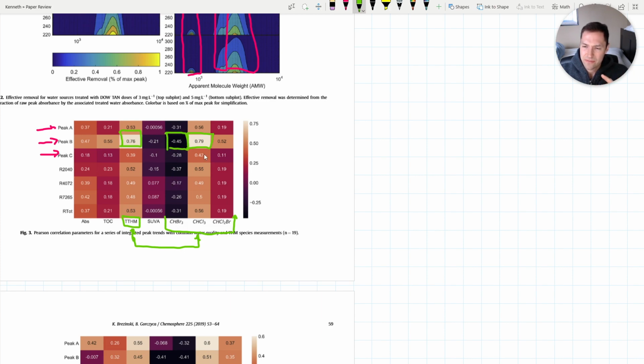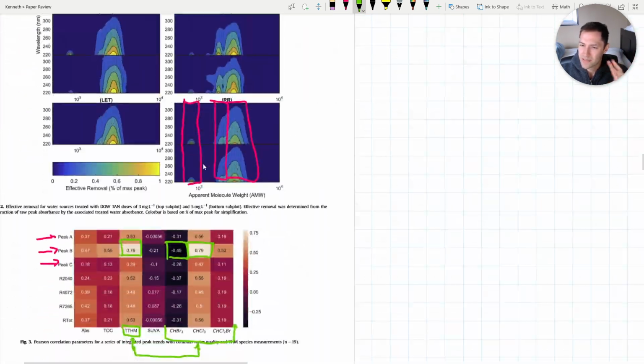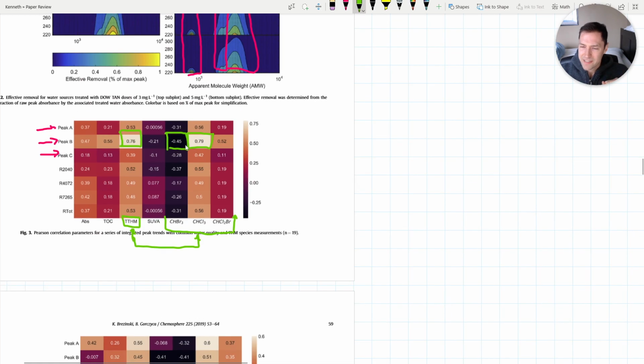It's sort of negative. And again, when we're talking about negatives and positives, you're only really concerned with anything above 0.6 and anything below -0.6. When we're getting closer to 0, there tends to be not so much relationship. We're getting closer to random noise. So it's a little hard to discern, right? But values closer to or above 0.6 are of interest to us. So this tells us something quite interesting.